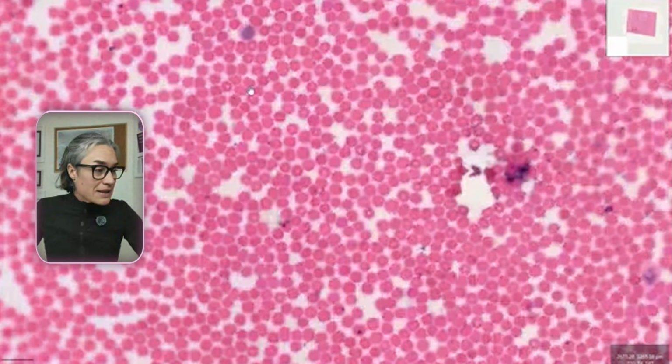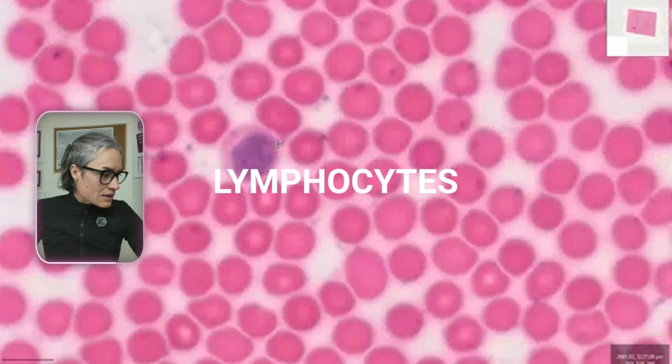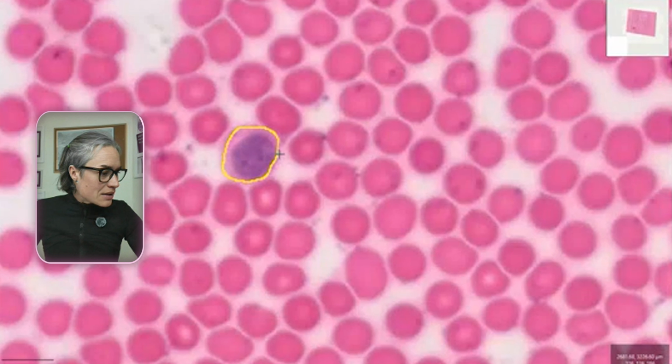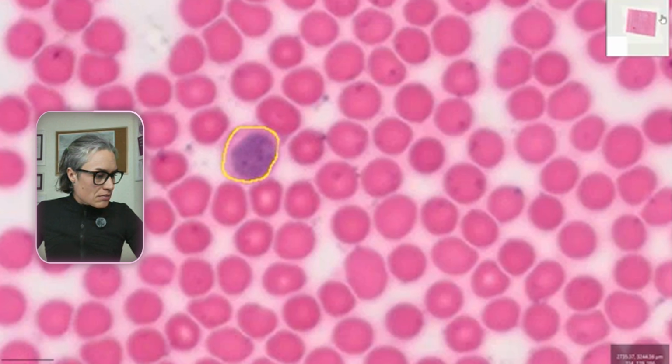And then I'm going to prick my finger and see what we can see. And it's not, oh yes, this one looks like a lymphocyte. Look at this guy. Slightly bigger than a red blood cell, but not as big as 2. And it has this nucleus inside that is very round and is not in parts at all. These are lymphocytes. Lymphocytes include B cells, T cells, natural killer cells. They take part in immune response as well.